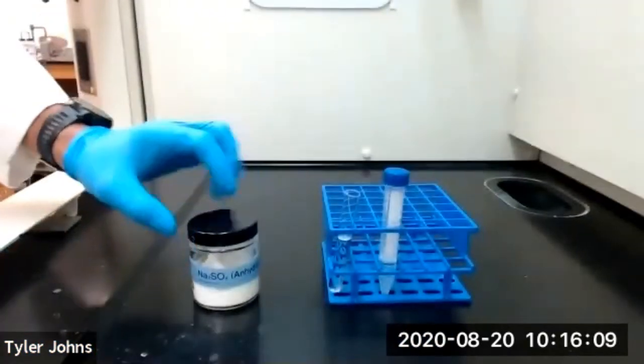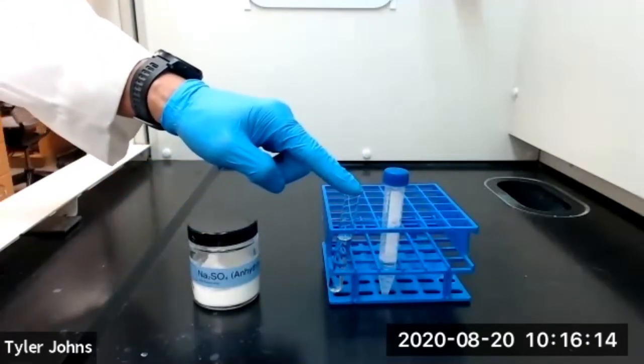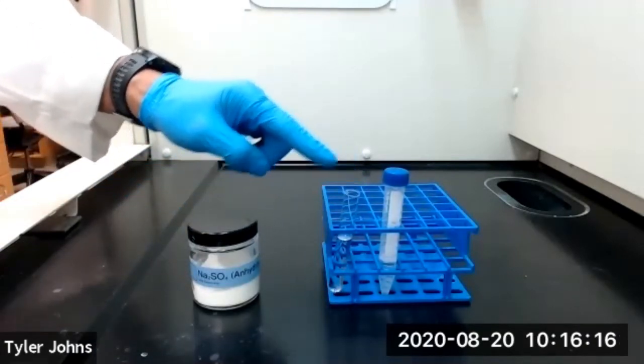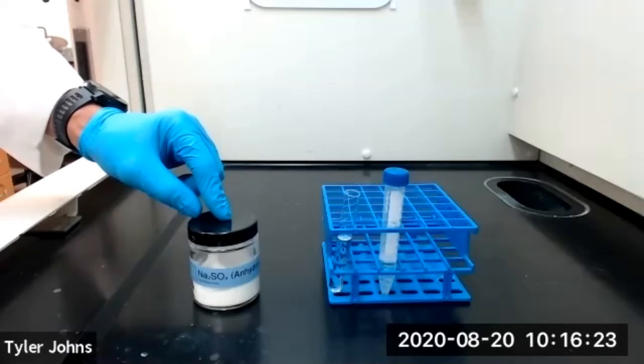We'll add anhydrous sodium sulfate to our organic layer until the sodium sulfate is free-flowing and no longer clumps. This will indicate that our organic layer has been completely dried.